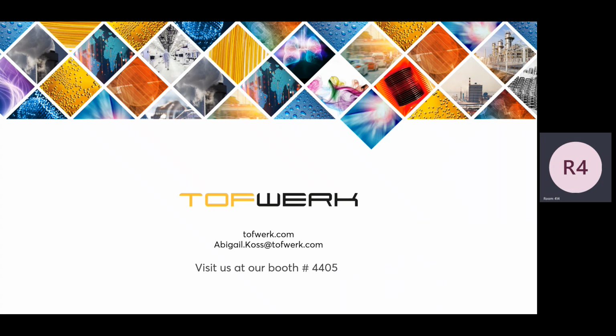Did you find any source for the styrene? So the styrene, I'm pretty sure most of that just comes from car exhaust. The buildup in the tunnel is a pretty clear indicator that it's coming from cars. That said, we do see a little bit of a hot spot around Sun 4 too. So I could absolutely imagine that being from that hydrocarbon mixture coming out of their infrastructure.